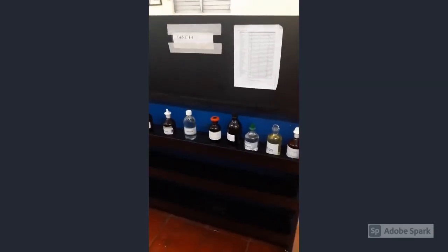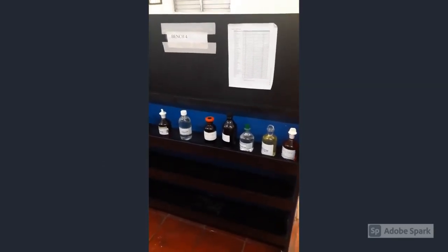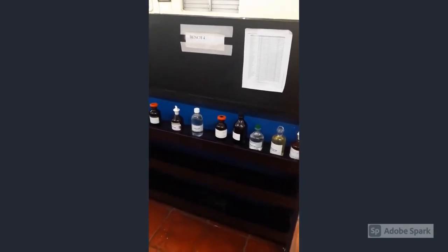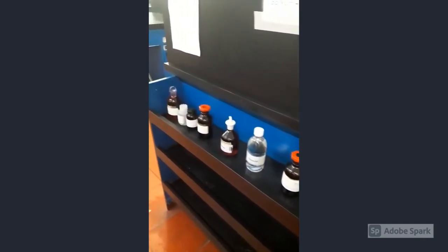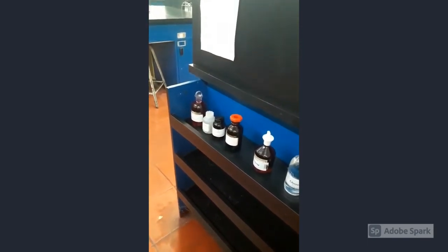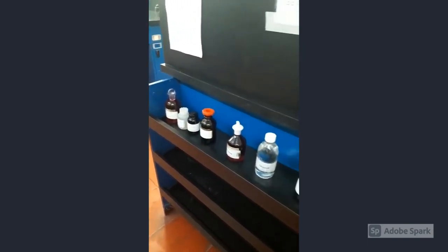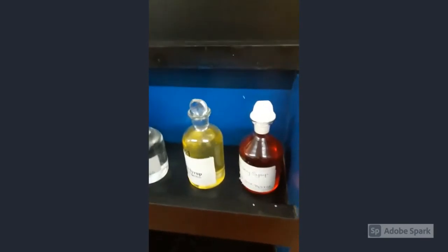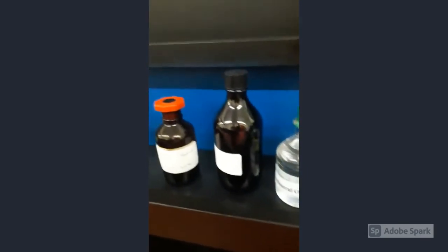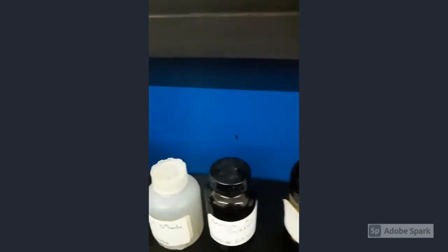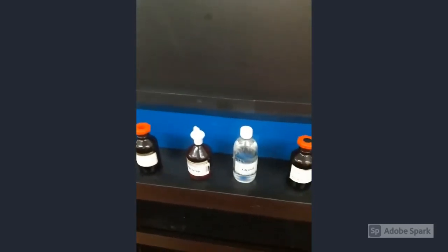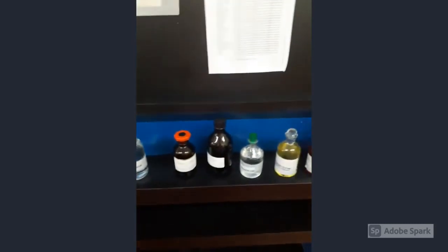The lab is separated into six different tables that have three students that are now assigned to each of them. At the end of each of the tables, you have individual stock containers that you'll take your products from to make your products or ingredients that you'll make your products. And then from there, you return them to the original place that you found them. They're normally kept in alphabetical order, and they're not shared among each bench. So each bench will have their own individual stocks.